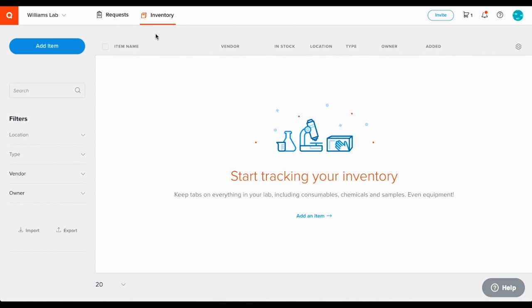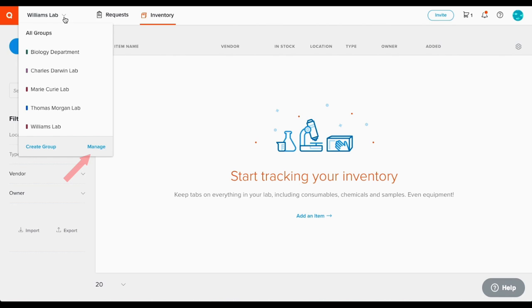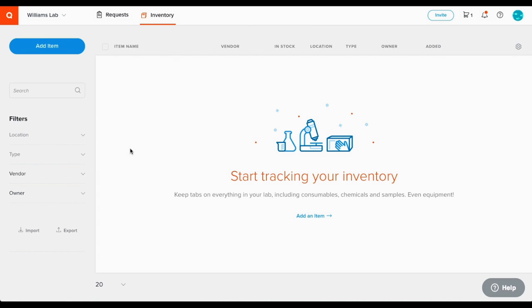Now here is the inventory. The first step when setting up your inventory is to customize locations and item categories in the manage groups area. We recommend doing this before you start adding items so you can make sure Quartzy is customized to your needs. You can find more detailed instructions about these group settings in the groups video. Just click the link on the screen.